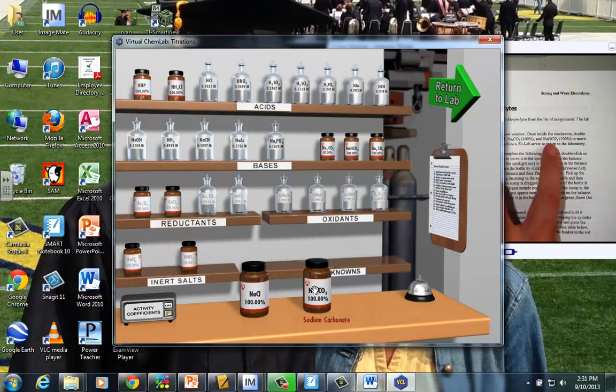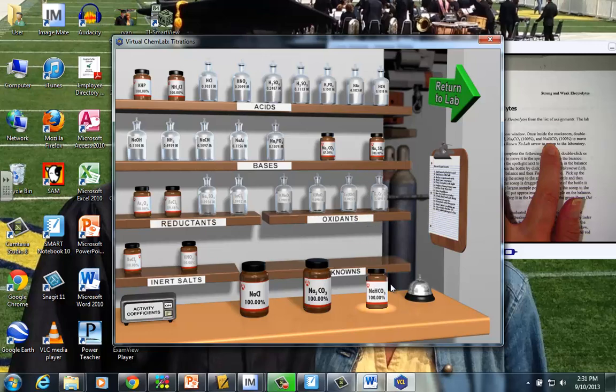And then sodium bicarbonate, which was right over here, baking soda. Alrighty, so we have the three jars sitting here on the shelf.